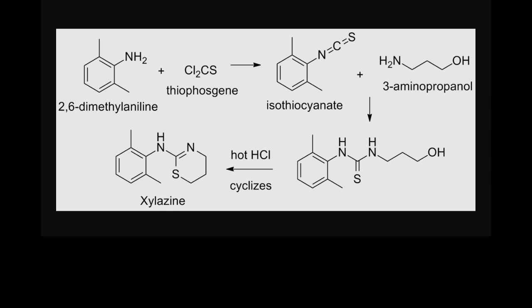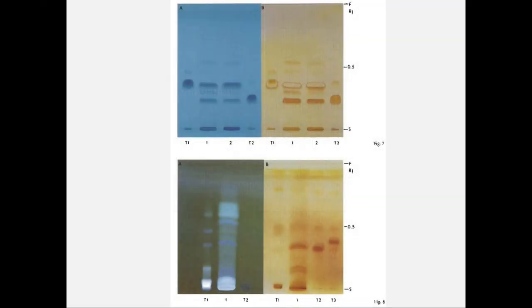I've not seen any reagent test results for xylazine specifically, although if anyone knows, let me know and I'll pass them along. Also, to my other fellow chemist peeps out there, if you've got an RF value for this in a mobile phase system, give me the composition of the mobile phase and the RF value. I will make sure other people hear it, because you can help people out with this, man. I don't know, we might save one or two junkies out there. Probably not, but hey, you never know.